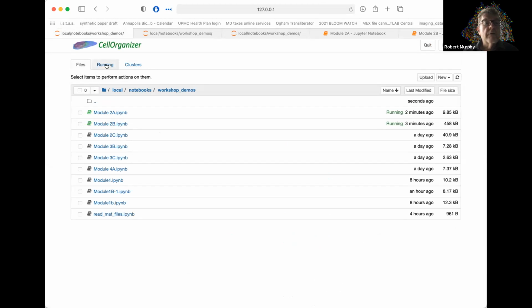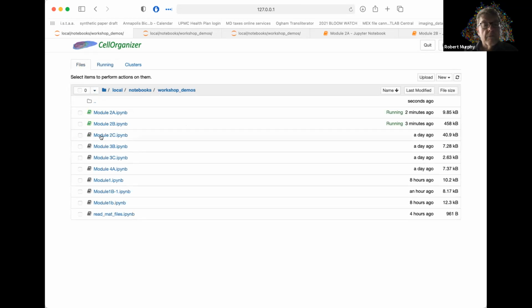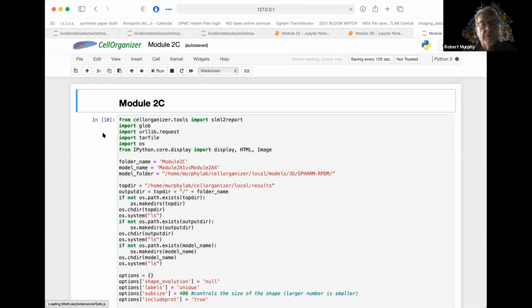I think you guys should still be able to see this. We're going to go to running, and we're going to shut down 2B. Maybe first we'll open up this and see if we need anything from it.